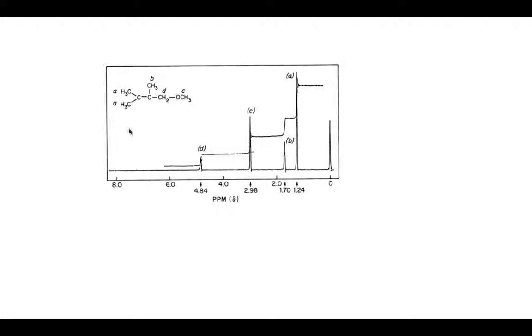If we take a look through them, we see that there are some hydrogens here. These would be identical. Both these hydrogens would tell the exact same story about where they are in the molecule. They're hydrogens attached to a carbon that's attached to this carbon right here, and these hydrogens are attached to a carbon that's attached to this carbon right here. So even though they're on different carbons, they're completely symmetrical. Therefore, they're both part of the same hydrogen environment. There's nothing different about any of them that we would be able to tell with this spectroscopy.